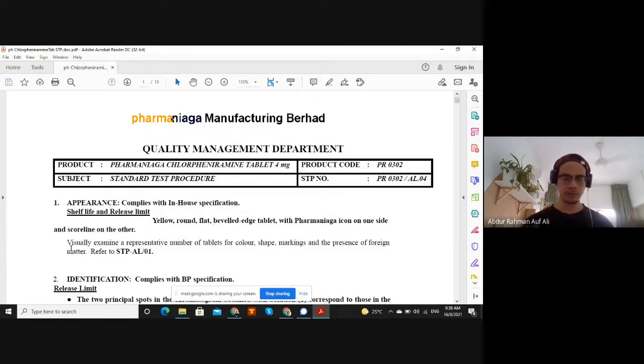So kalau macam katalah untuk Japanese pharmacopoeia kena pakai this instrument, tapi kita tak ada this instrument. So tak boleh nak test chlorpheniramine tablet menggunakan Japanese pharmacopoeia methods. So saya check US pharmacopoeia, okay, this chemical kita ada. Method untuk test chlorpheniramine, chemical tu kita ada. Instrumen ni kita ada.